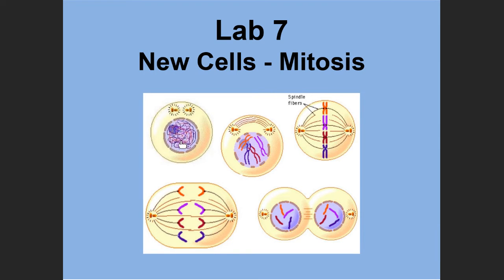All this cluster in here is the DNA contained within the nucleus, and then this is the nucleolus. The halos, the little sun things out here, represent a region in the cytoplasm called the centrosome. And these little things here and here represent non-membranous organelles called centrioles that are required for cell division.